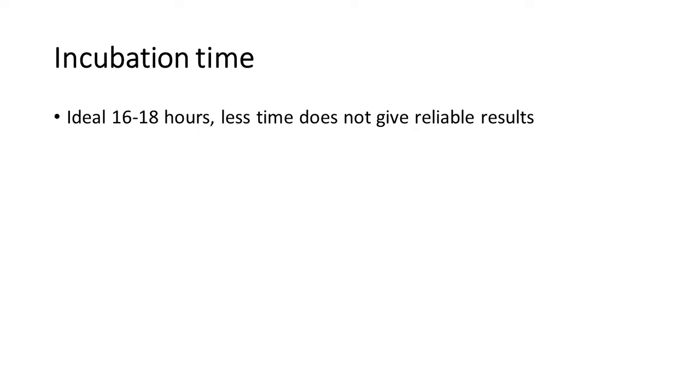For example, if you keep at 35 or 37 Celsius, you can keep 16 to 18 hours. But if you keep at room temperature, that means 25, you have to keep it a long time, 2 to 3 days or more. That means 3 to 7 days. Okay.